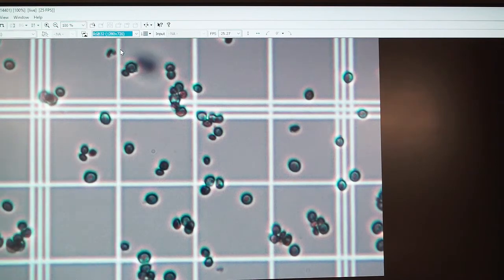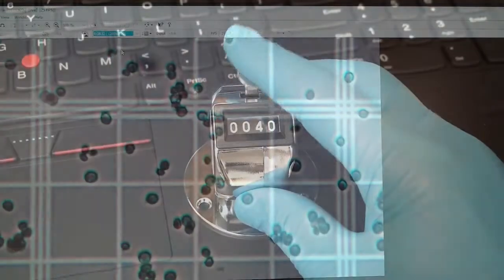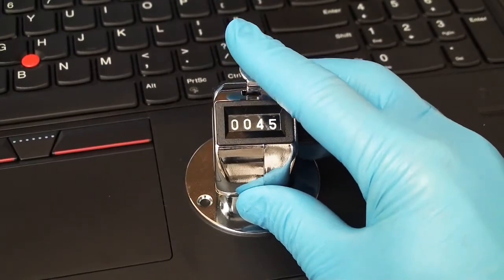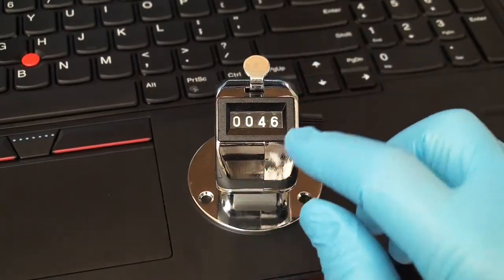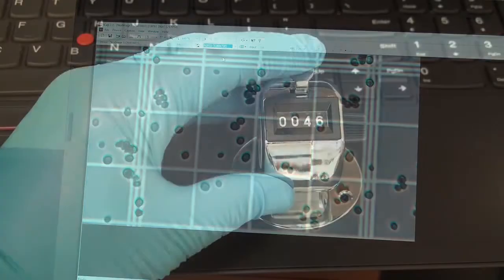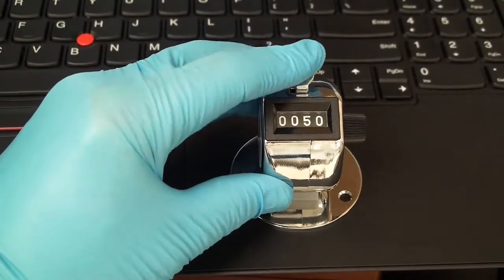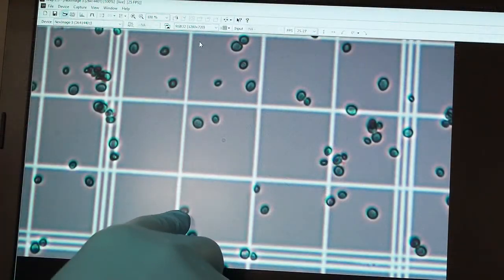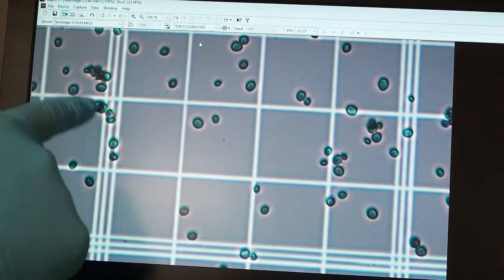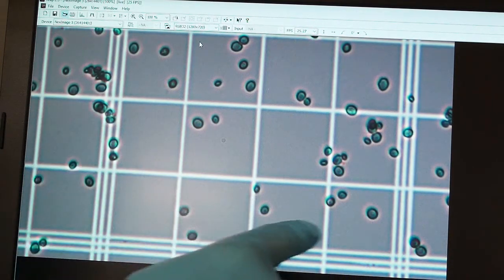I'm going to count the cells and see how many I have in the first full square millimeter — that turns out to be 46. Then I go across and count the upper right-hand square, again using just the top and the right as my limits. Anything that hits the left and the bottom, I don't count.